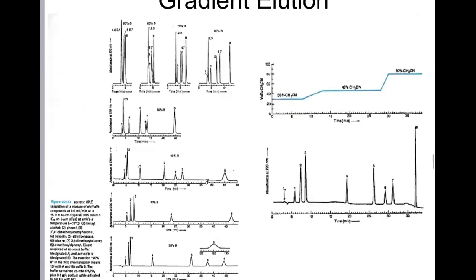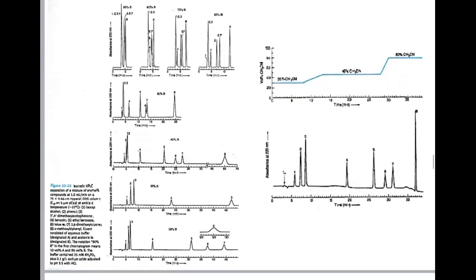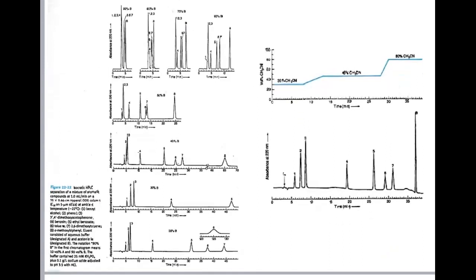Here's an example of gradient elution. In this particular experiment, they ran this gradient, which is a volume percent, I think, of acetonitrile, if I can read it correctly, over time. So what this figure does up in the top right corner is explain to us what is the composition of the fluid. That's the mobile phase, okay?